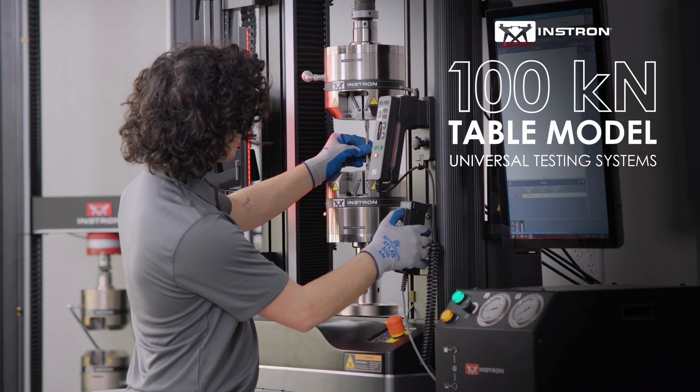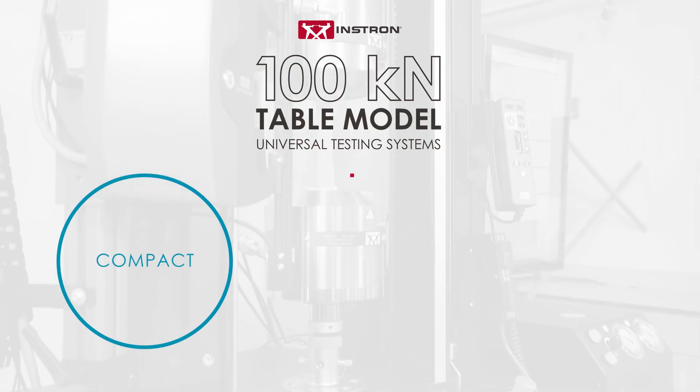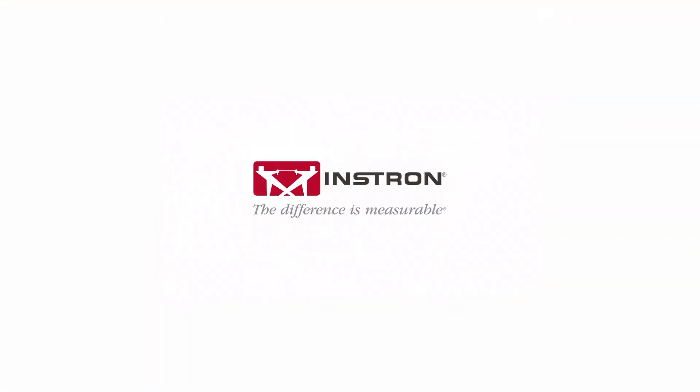The Instron 100 kilonewton table model universal testing systems — compact, powerful, and ready to deliver exceptional performance. Instron: the difference is measurable.